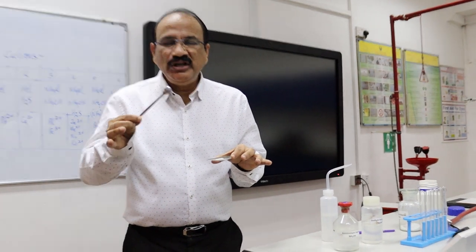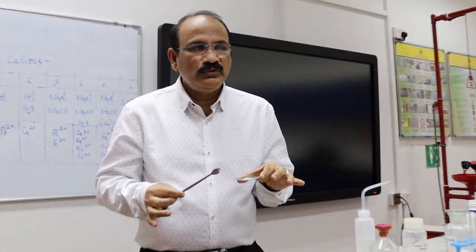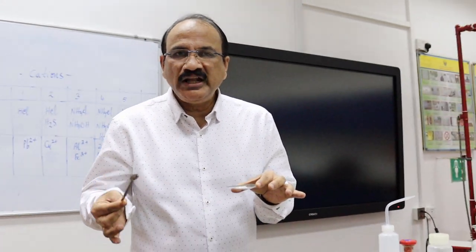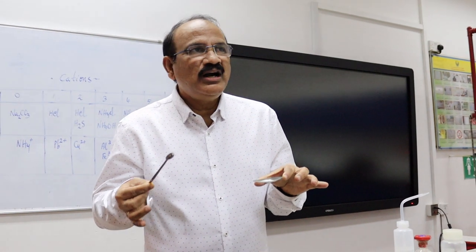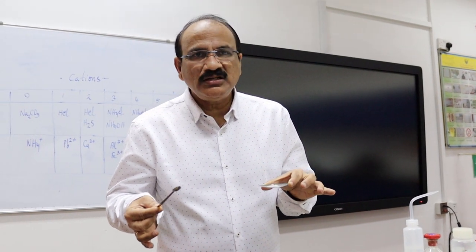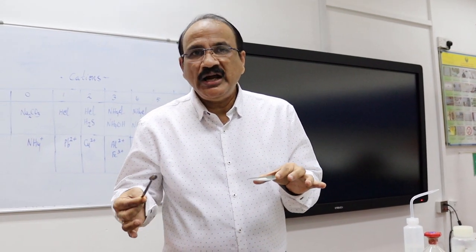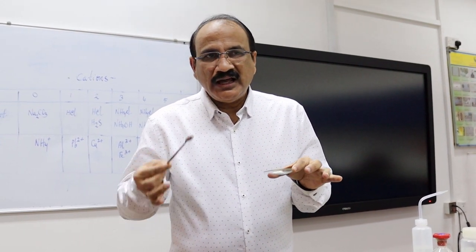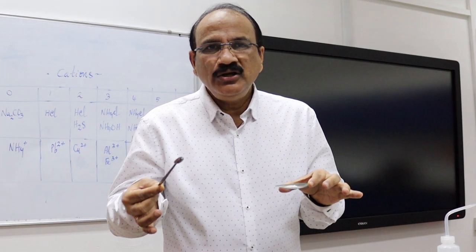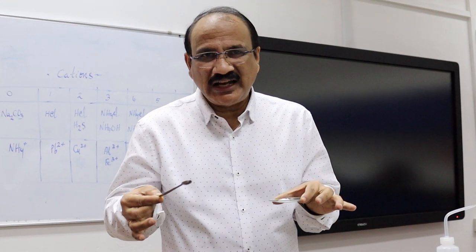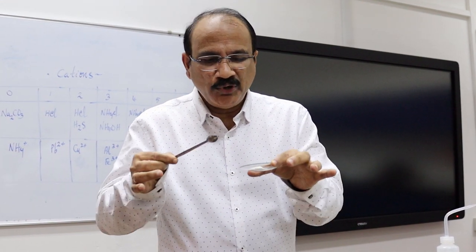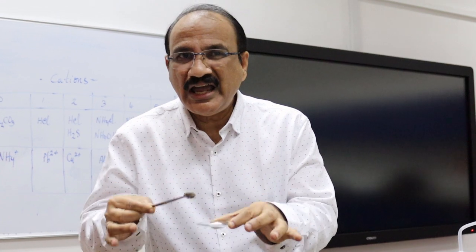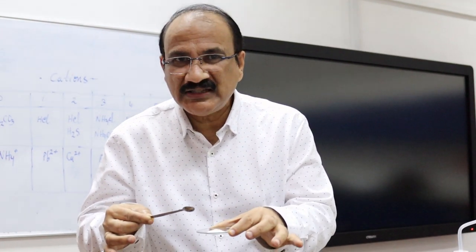Okay students, we are into group 3 now. As you know, the group 3 reagents are ammonium chloride and ammonium hydroxide, and the typical group 3 cation is Al3+. So I am going to show the reactions of Al3+.